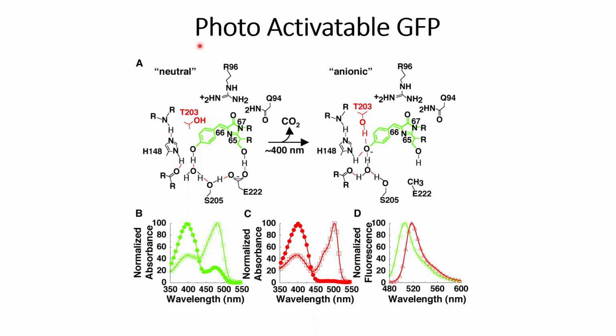In this video we will discuss a new type of measurement to measure the proteins within the cells, that is photoactivatable GFP. How this works is that we can use a laser of a specific wavelength to activate our reporter proteins, and then after activation use a specific wavelength to excite the proteins and see the signals, whether our protein is present within the sample or not. So this sounds like a confusing statement. We will try to understand it through the explanation of this figure.